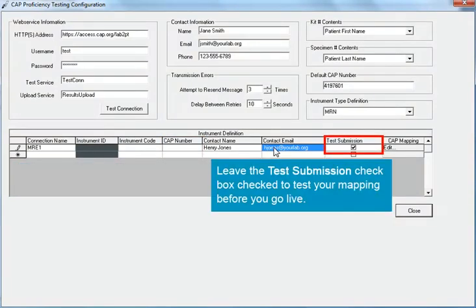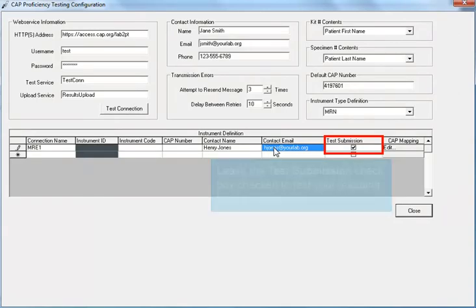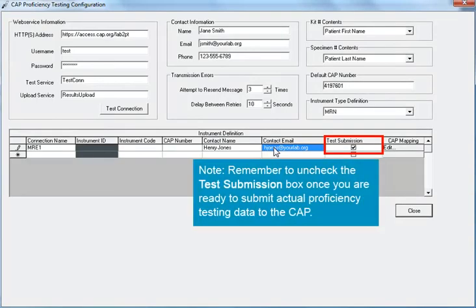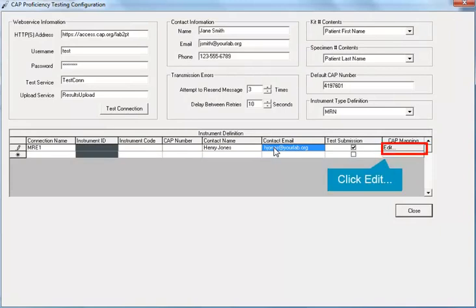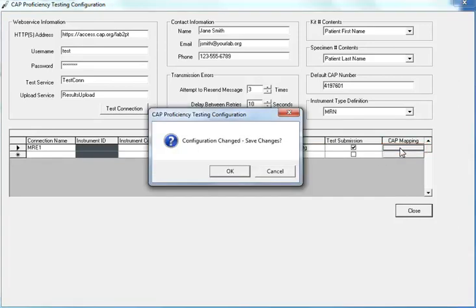You can leave the Test Submission checkbox checked to test your mapping before you go live. This process is explained in another eLearning module. Remember to uncheck the Test Submission box once you are ready to submit actual proficiency testing data to the CAP. Next, click the Edit button on the far right, under the CAP mapping column. If a pop-up dialog asks you if you want to save your changes, click OK.